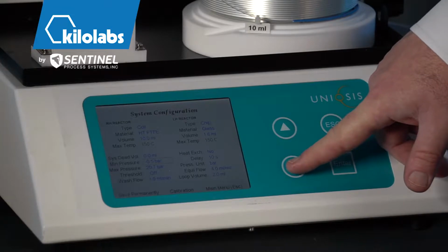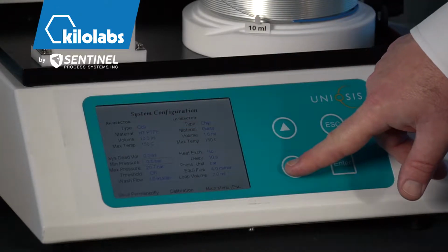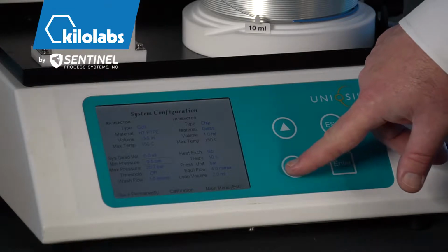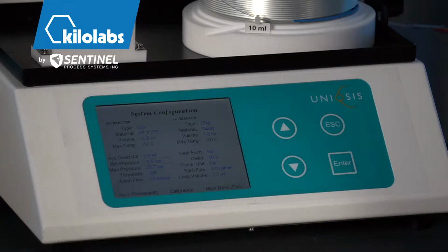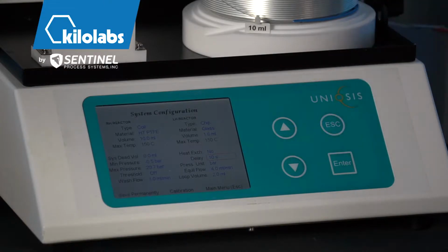There's no heat exchanger. There's a minimum pressure of minus 0.5 bar, and that's so that if you go below that minimum, the system will shut down. The reason it's slightly negative is in case there's a bubble in the system. You don't want the system to shut off. And in essence, by priming the pumps and getting them set up correctly and measuring the pressures, you'll know if you have a bubble in the system or not. You can also see it with the visual ones.